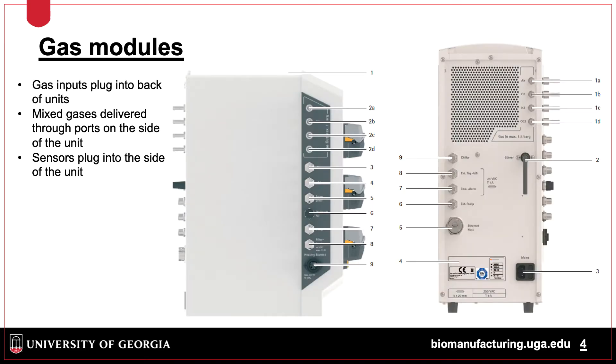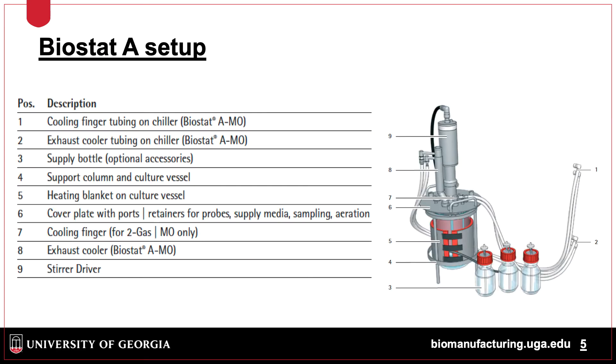To set up, gases are installed in the back of the system and devices called mass flow controllers alter the gas coming out of the side depending on the demands of the culture. Shown here is a typical setup with acid, base, and feed or antifoam bottles. The system utilizes a heat blanket and cooling finger inside the vessel to regulate temperature. The exhaust is cooled in a condenser so liquid does not evaporate, and a stirrer drives the agitation inside the vessel.